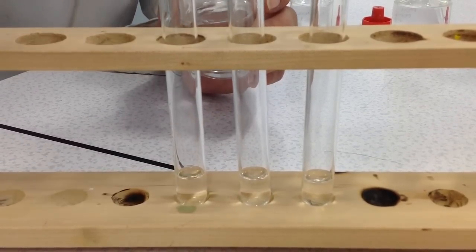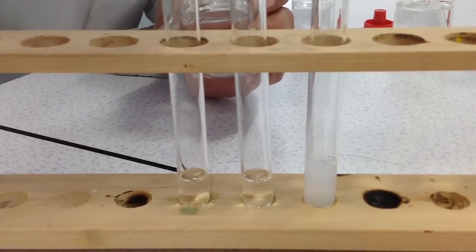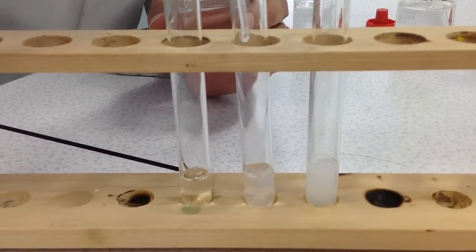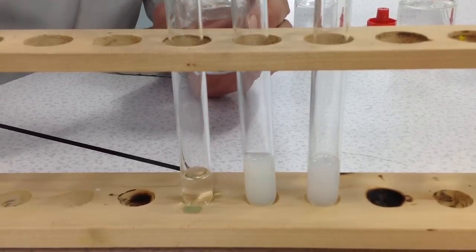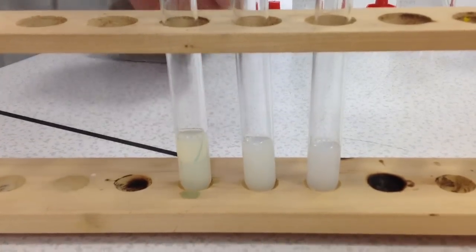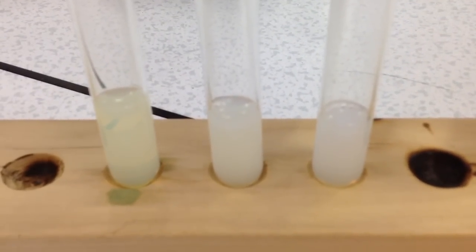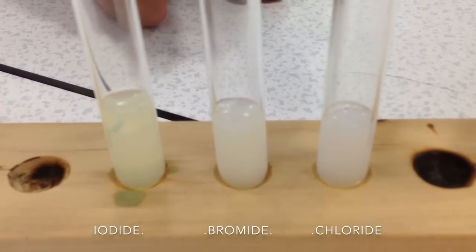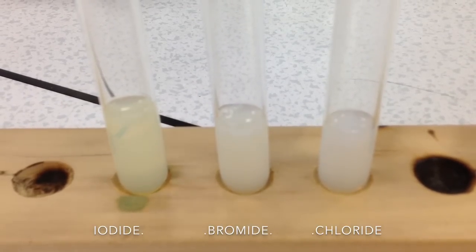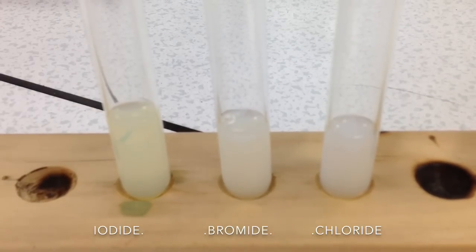So in the sodium chloride tube you can see there is a white precipitate forming. In the potassium bromide tube you can see there is a creamy white precipitate, and in the potassium iodide tube over here you can see there's a yellow precipitate forming.